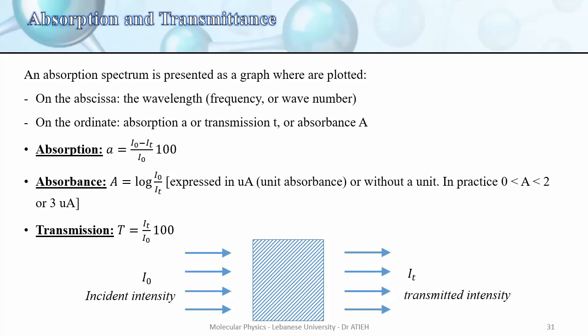Good morning. Today's video is the continuity of the previous video in which I was explaining chapter 1. This part is actually called photospectrometry. It deals with measuring the transmittance or absorbance of light when it passes through a given sample, mainly to calculate its concentration. What is the advantage of using photospectrometry?